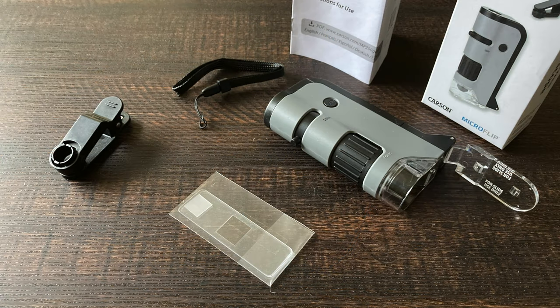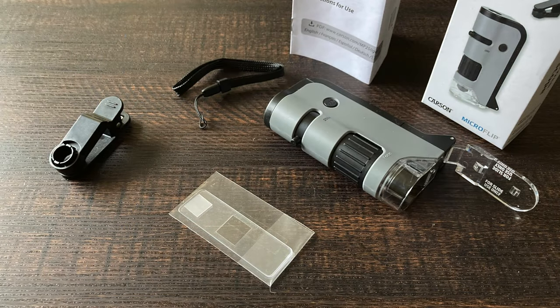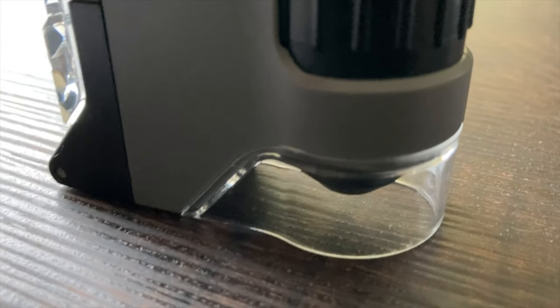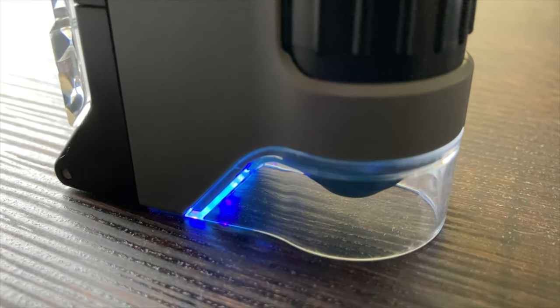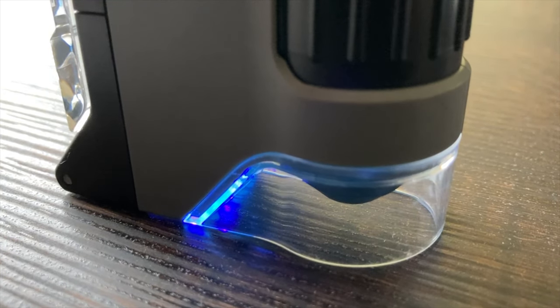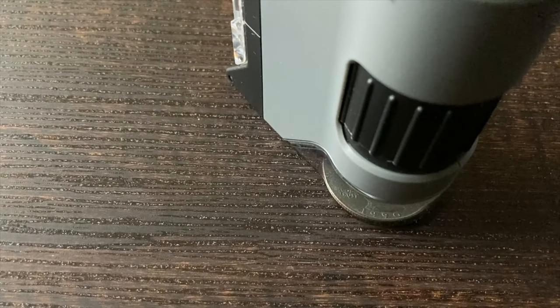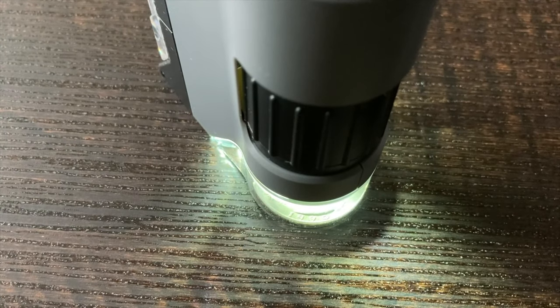There's a small instruction booklet, though I barely glanced at it. There is something important to know: the battery is not included. It uses a single AA battery to power the LED light. What surprised me is that it also has a UV light, which concerned me — as I can't see UV light. The microscope glows with a bluish light when the UV is active. The UV light has to be held to be used, which I thought was a good idea. The main LED light can be turned on or off with the press of a button.